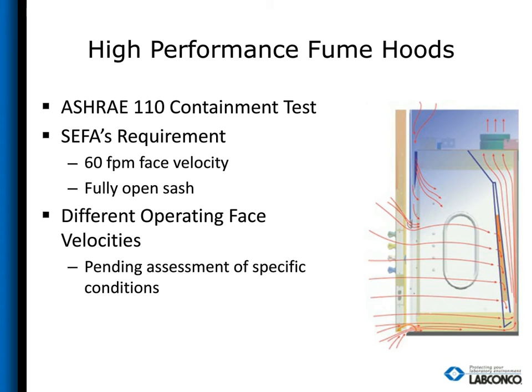So if this test was actually done in the field as installed or as used, those are two other parts of the test that can be done, it allows an average of 0.1 parts per million of the tracer gas to be detected with the same sash position and face velocity setup. So keep in mind, manufacturers that say their hoods are high performance should have the test reports to back that information up. So once again, I challenge you as a consumer to ask for these test reports.